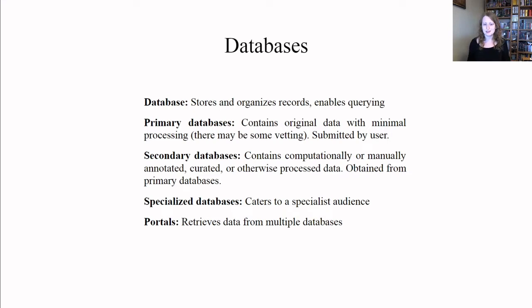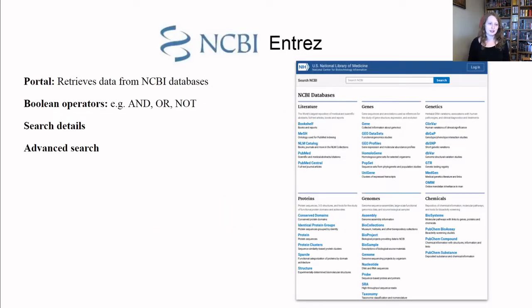So it's a nice shortcut for accessing many different databases with a single search. It is with a portal that we start off our introduction to this lab, namely the Entrez portal, which retrieves data from the NCBI databases.